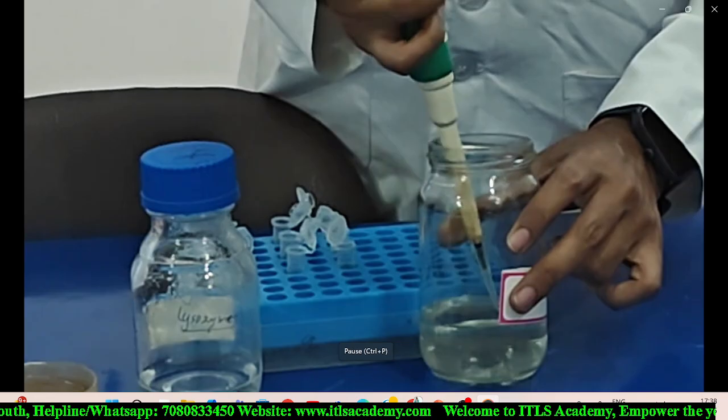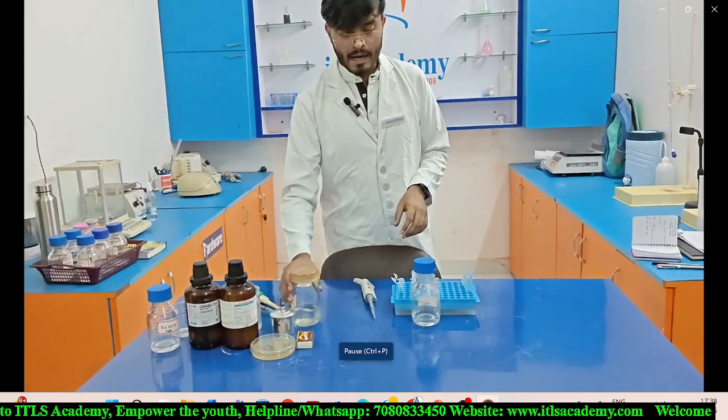So after adding 75 microliter of 10% SDS to each eppendorf, now we need to add 7.5 microliter of lysozyme to each eppendorf. So here we have already set 7.5. Now I'm going to take 7.5 microliter of lysozyme and pour it into each eppendorf.